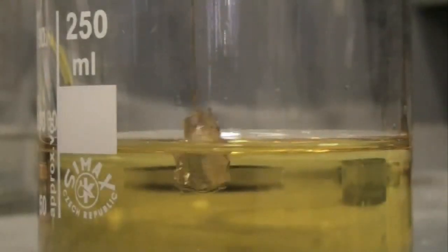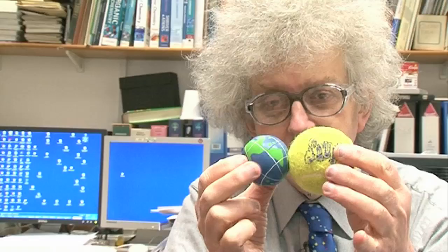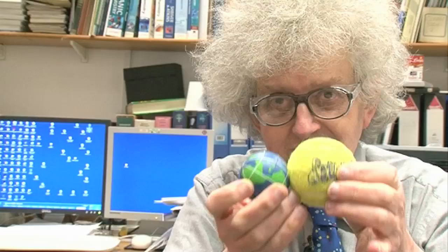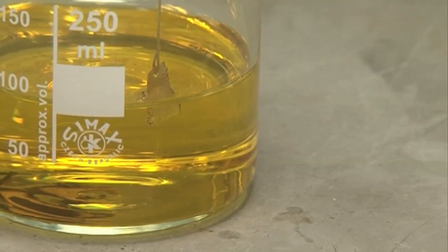Aqua regia is a mixture of hydrochloric acid and nitric acid, but each of those is a solution of something in water. Hydrochloric acid is hydrogen chloride, which is an atom of chlorine bonded to an atom of hydrogen. When the HCl dissolves in water, the bond between them breaks and you get chloride ions — Cl minus — and H plus, hydrogen ions. It is the formation of hydrogen ions that makes something an acid. So when you have the mixture of all these ions, you get quite a soup.